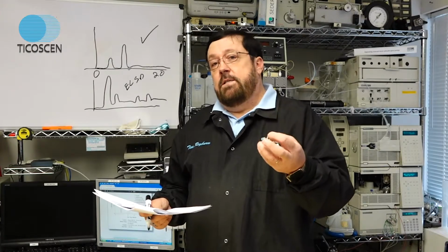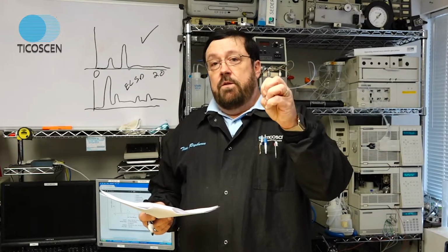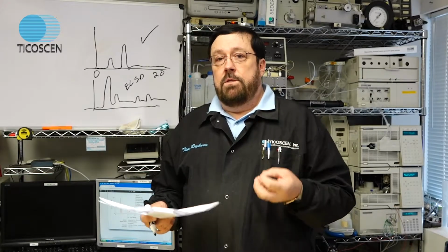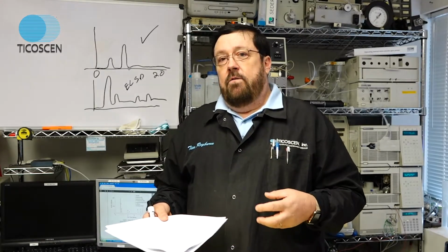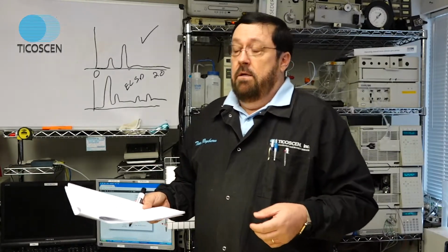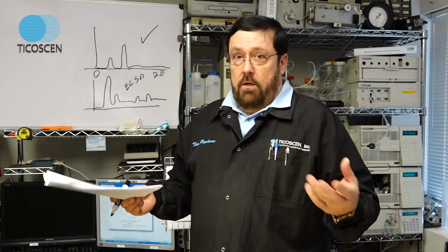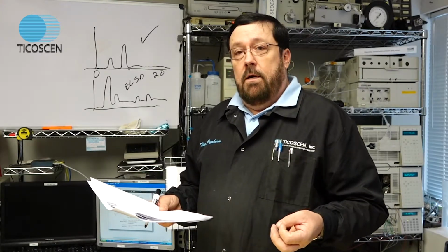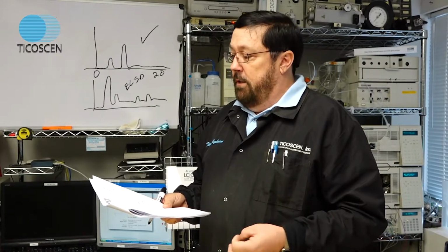It's a multivesicle and single-vesicle spherical lipid they encapsulate with bupivacaine, which is a Novocaine product. And it's a very amazing product. It's currently on the market. I won't plug them, but they use ELSD to make and manufacture this. And it's a very excellent opioid alternative. But they're analyzing a lipid, which is a non-chromophoric compound they encapsulate the target molecule in.